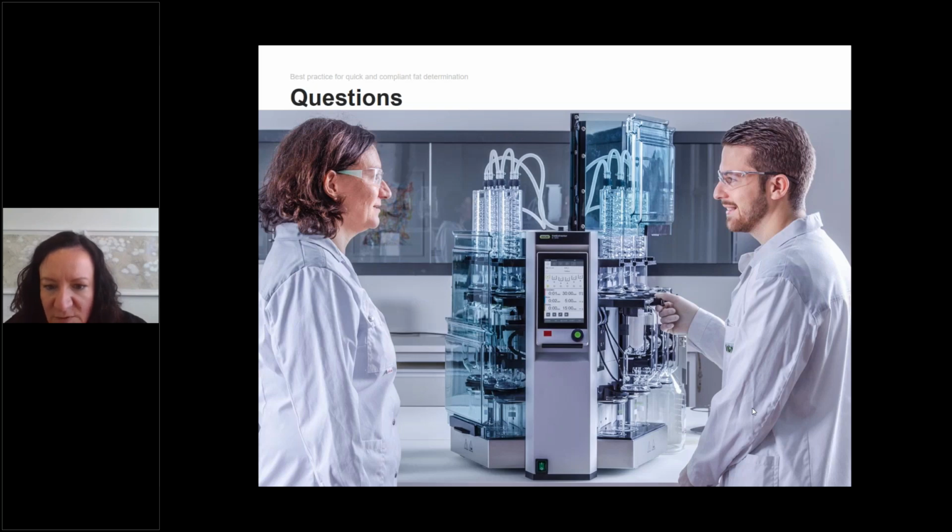What is the difference between the universal extractor and the E-500? I mean, how can one be used with any type of solvents and the other with the mentioned ones only? Yes, this is one big difference. So the heating power is different. It's not possible to boil high boiling solvents on the fat extractor, but only on the universal extractor. But there's also other differences.